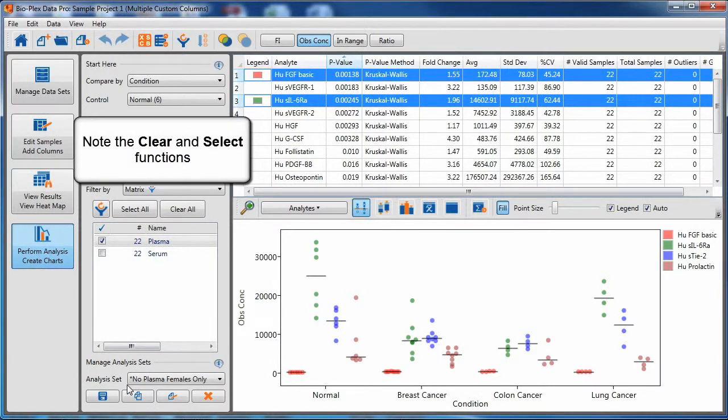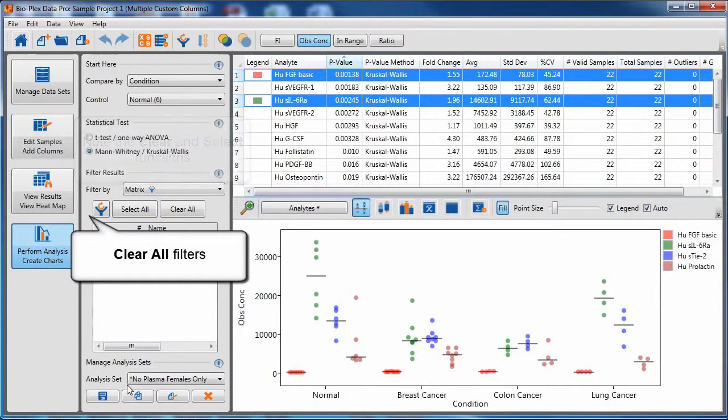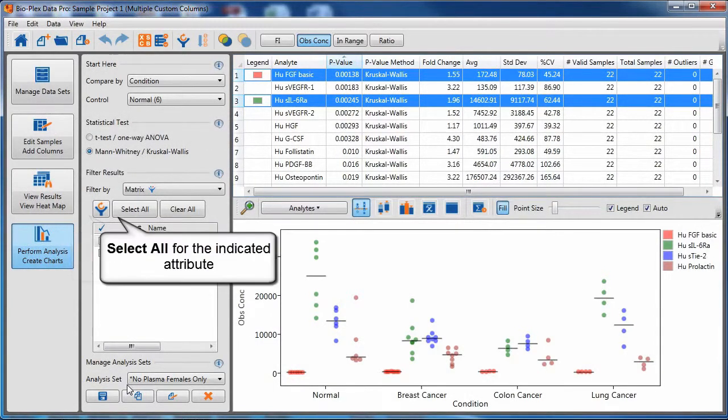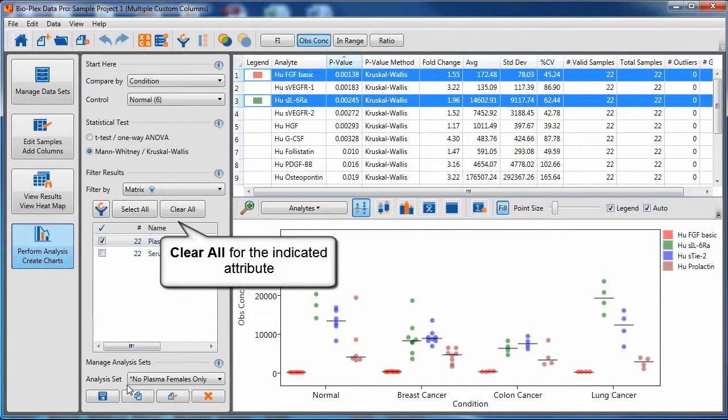Note the clear and select functions along the top of the filter tool: clear all filters, select all for the indicated attribute, or clear all for the indicated attribute.